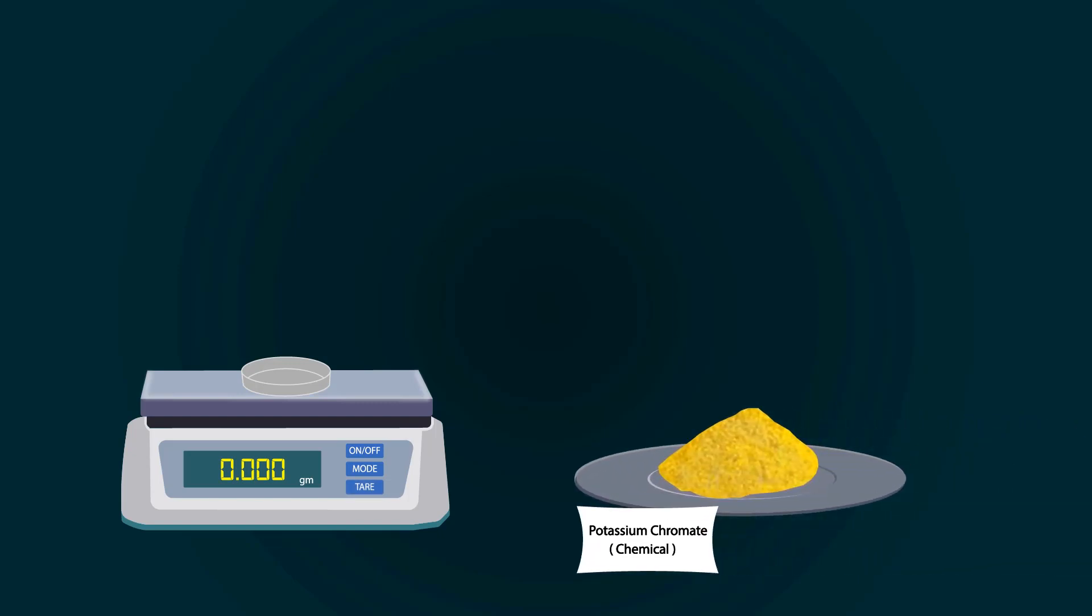Now take potassium chromate chemical from the stock bottle. Put potassium chromate chemical into the petri dish with the help of a spatula. Weigh precisely up to 10 grams.